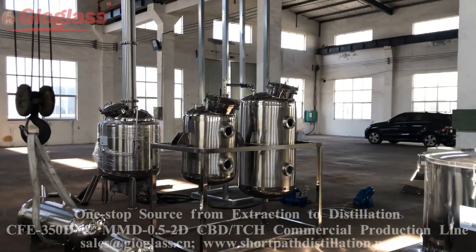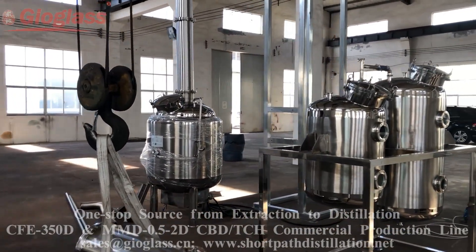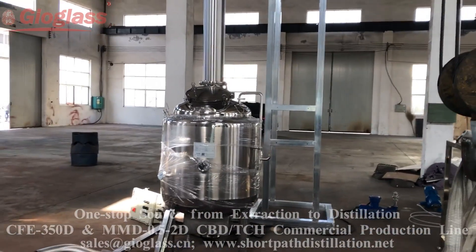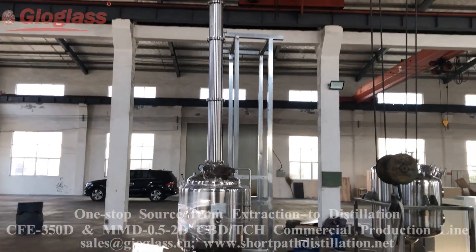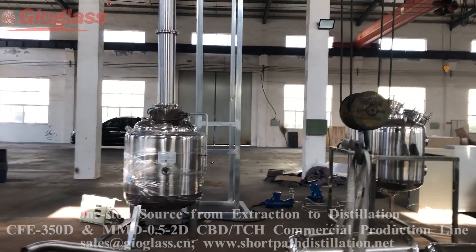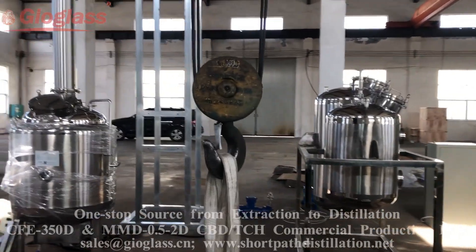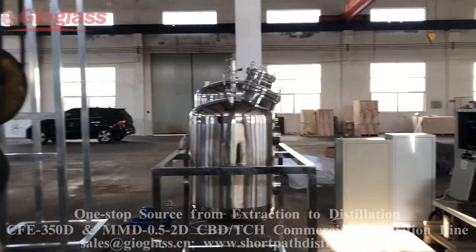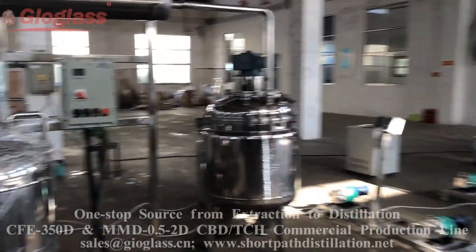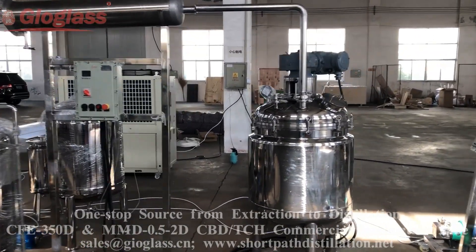When the purity of the ethanol decreases to 85%, we need to use the rectification column to purify it. It can remove the water and some of the impurities in the ethanol. The purity can be brought back up to 99%, then it goes back to the centrifuge extraction.